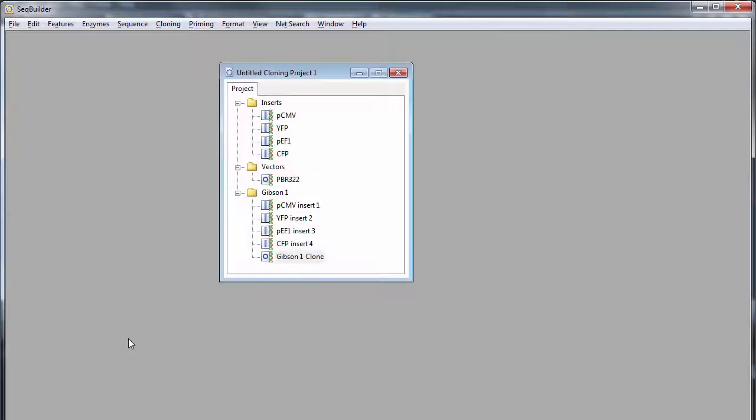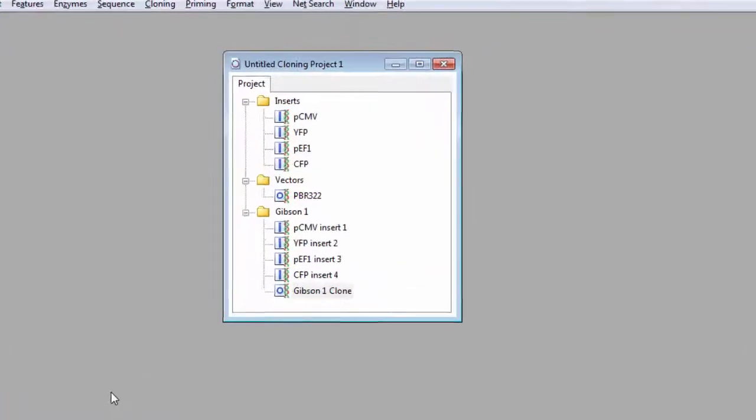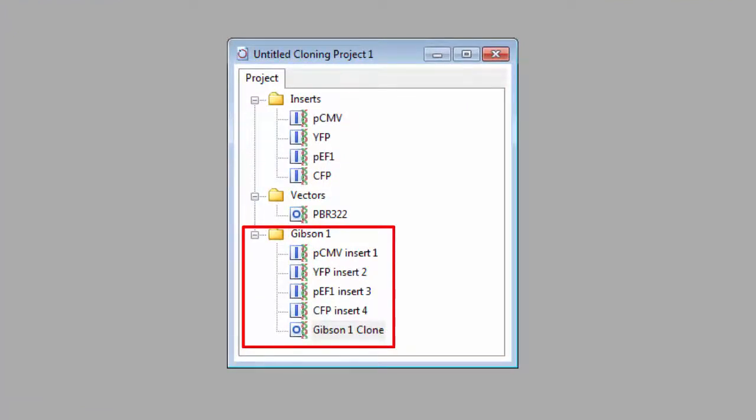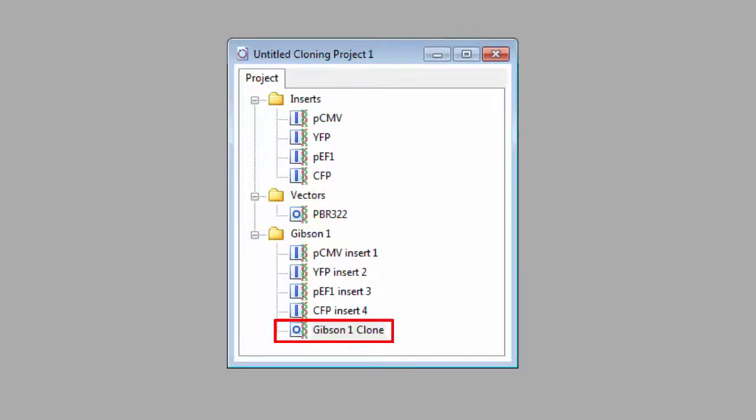Once your virtual clones have been created, a new folder is added in your cloning project window. Depending on the method used, this folder may contain a copy of each insert and entry clone, as well as the finished expression clone that will be created after recombination occurs.